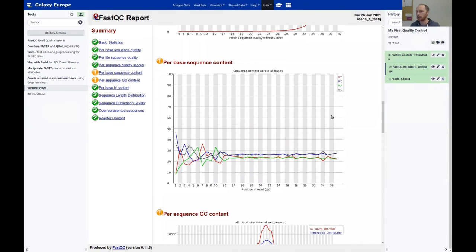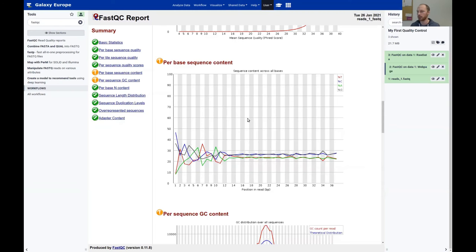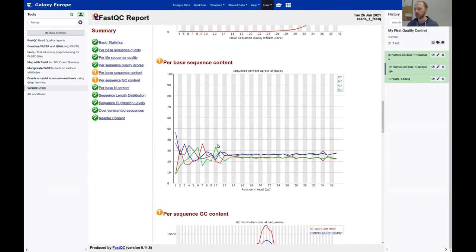The next one is the per-base sequence content — there's a warning sign here. On the x-axis is the position in the read; on the y-axis is the fraction of reads with each nucleotide at that position. Ideally you'd expect a flat distribution, but here we have bumps at the beginning — probably due to a bias from the protocol. For ChIP-seq or CLIP-seq this might be expected because of protein binding to certain regions or the extraction or fragmentation enzymes. If you're not expecting this, it could indicate biased fragmentation, adapters, or contamination.